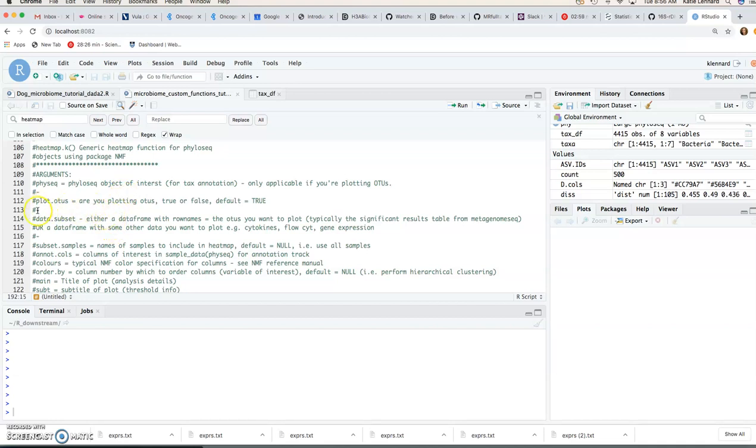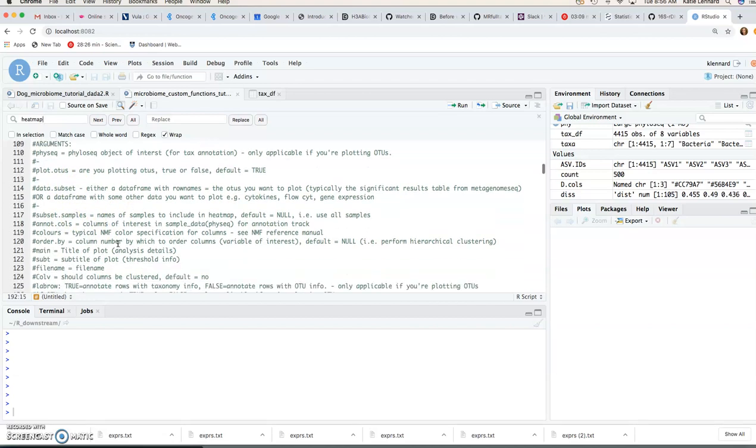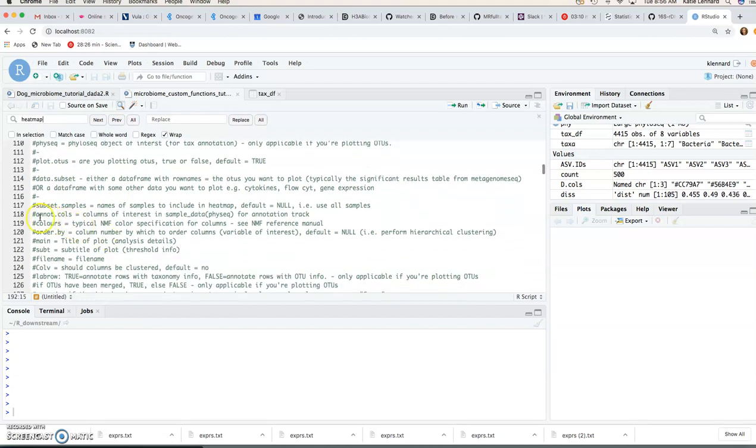You can for instance subset your data either by rows or columns. So choose specific OTUs or samples that you want to plot and then what's very useful is you can also specify columns of interest that you want to add as an annotation track to the top of your heatmap.